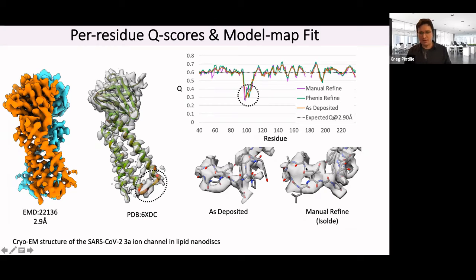I think it's still a bit of an open problem how to better fit models in cases like this, because the protein backbone has a lot of flexibility, but at the same time, it still has to fit certain dihedrals, angles, and things like that. So there are still some limitations in trying to fit it well to the map. But again, that's a really interesting active area, I think, how to refine and how to optimally build models in cases like this.